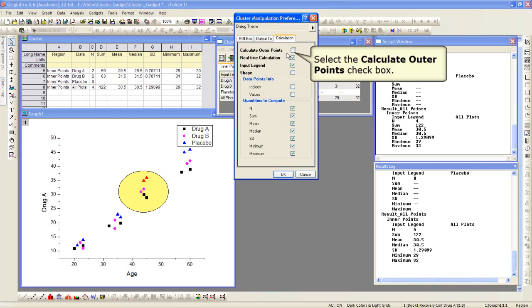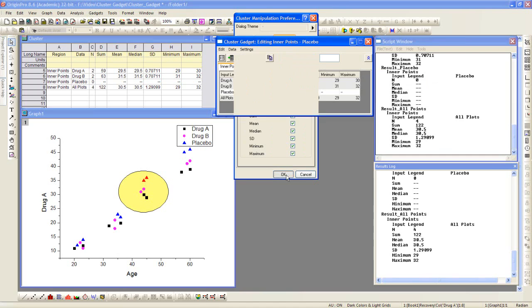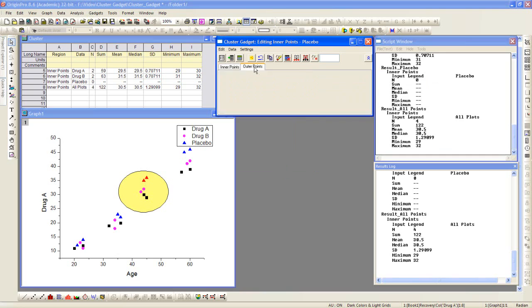you need to check this calculate outer points check box. Upon checking it, you can then click on the outer points tab, and that will show you the stats for data points outside of the ROI box on the graph.